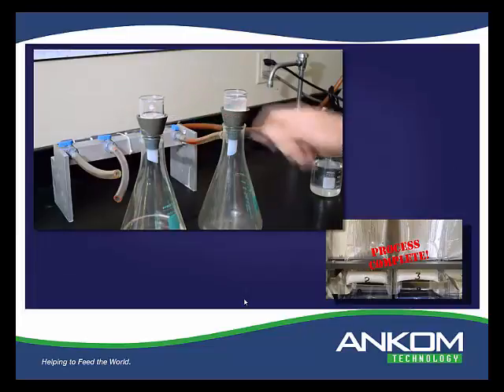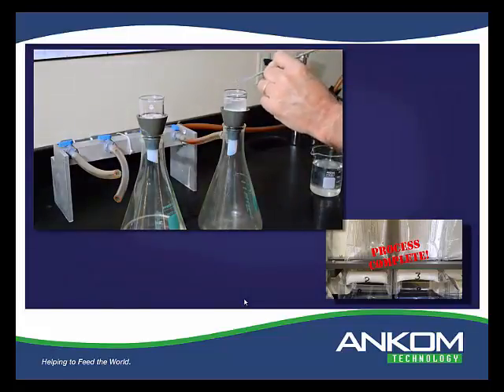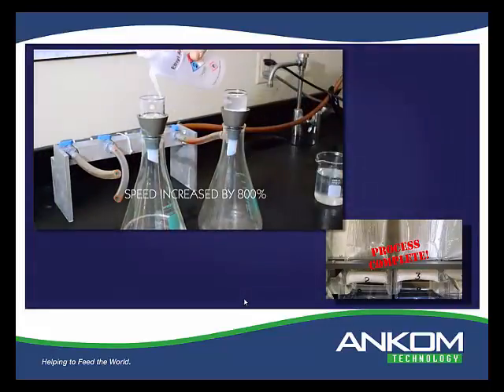So I'm the person that's trying to let you see how much of a long difference there is, but even in my frustration, I ended up cheating, so to speak, in order to speed it up. Well, now put that on a technician that's got lots of other work to do. The same thing can happen, and that's what causes problems with both accuracy and precision.